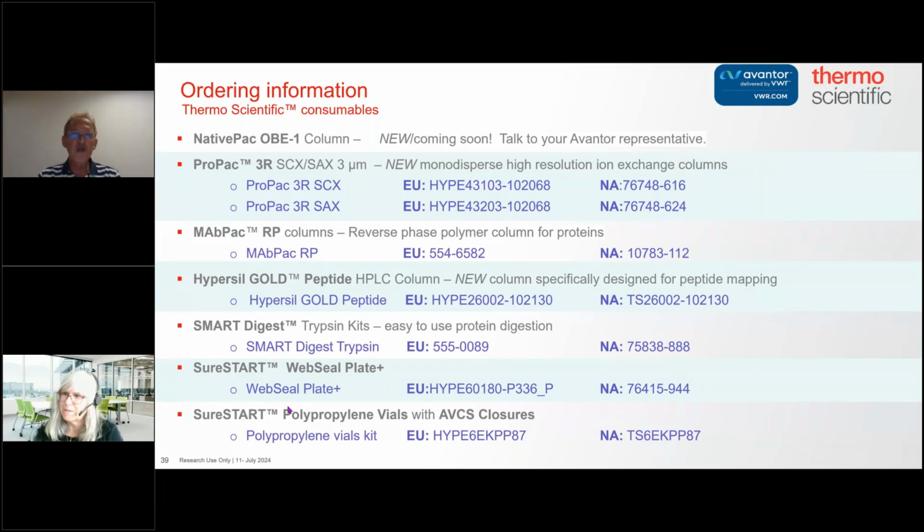The only reason we looked at that C4 is because we had a specific problem. And then I thought, well, we'll use the hydrophilics, but you don't. And then you realize afterwards, of course you're not going to do that because you've got a high carbon load on these columns. So basically the reason C4's never been thought of before is that people tend to copy what's been done before. And now with other analytical techniques we should be thinking things through a bit further as well, and I've seen a few of those coming up.